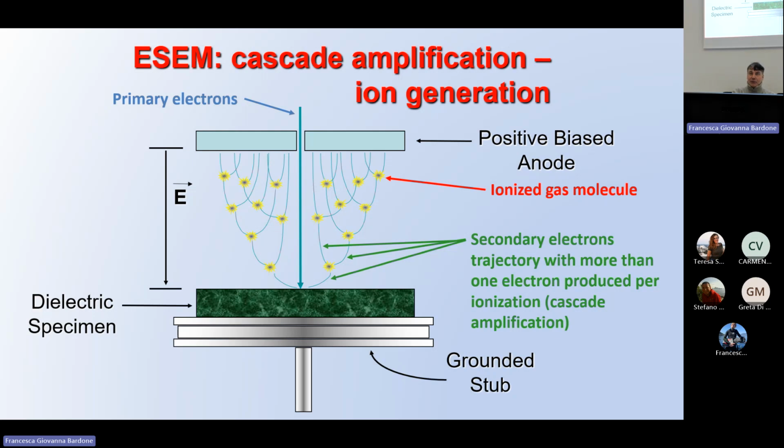The secondary electrons produced are amplified by the water molecules, by this effect, without any need of specific preparation or whatever. Every secondary electron produces a huge amount of electrons due to the molecules which are close to the surface, automatically. You need only to collect the final number of electrons by this anode.